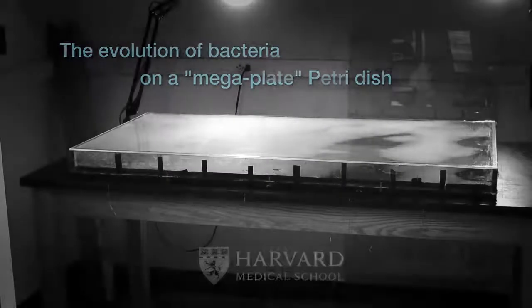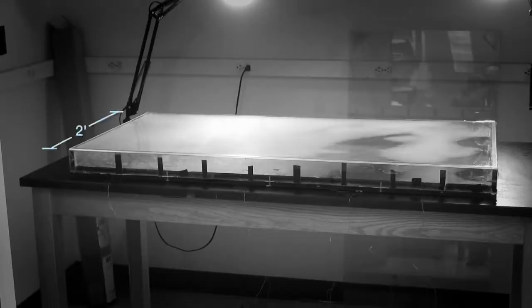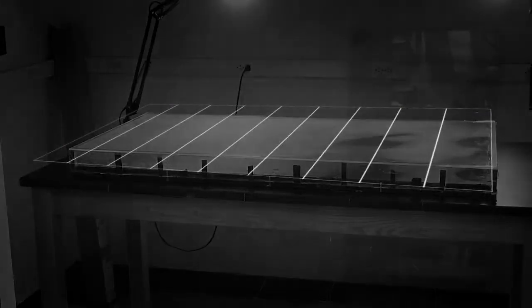So what we ended up building was basically a petri dish, except that it's two feet by four feet. And the way we set it up is that there are nine bands and at the base of each of these bands we put a normal petri dish thick agar with different amounts of antibiotic.